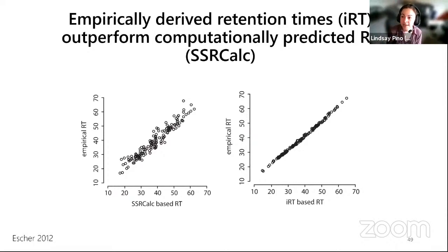So Susanna asks, does IRT work when your retention times do not change linearly? It does get a little trickier, but Skyline does have other fits besides linear fits. So you can definitely play around with that. I think most people do not get quite as fancy with their liquid chromatography. So first, I commend you for doing nonlinear gradients and maybe more interesting multi-step gradients there. But yes, Skyline has nonlinear options for retention time calculators.